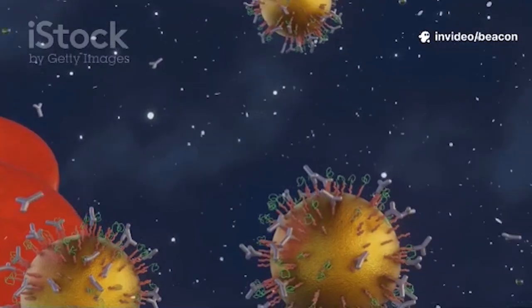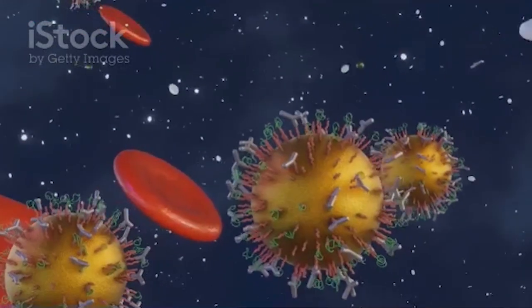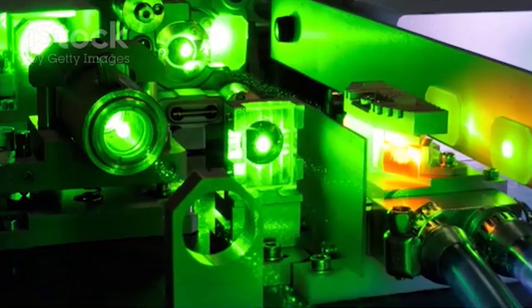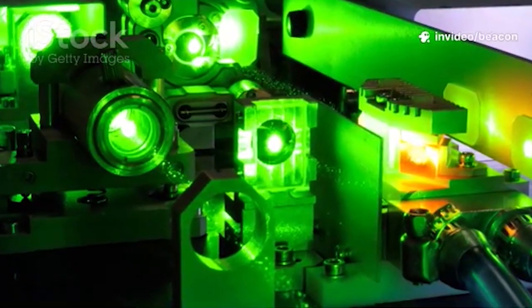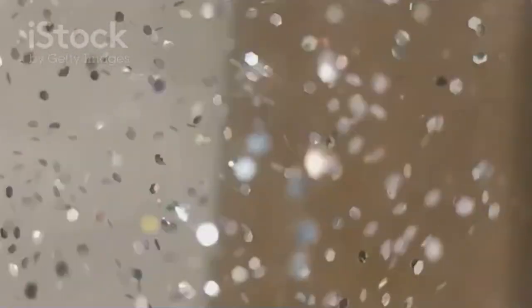The particles are constantly jiggling around because of Brownian motion, so the scattered light isn't steady. A detector picks up that scattered light, and the intensity keeps flickering over time. By analyzing how quickly those flickers change, a computer can figure out how fast the particles are moving. And since smaller particles move faster than larger ones, we can calculate their size.